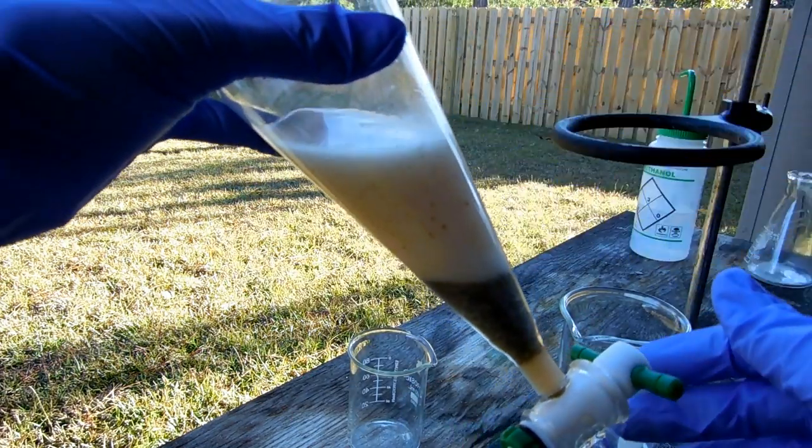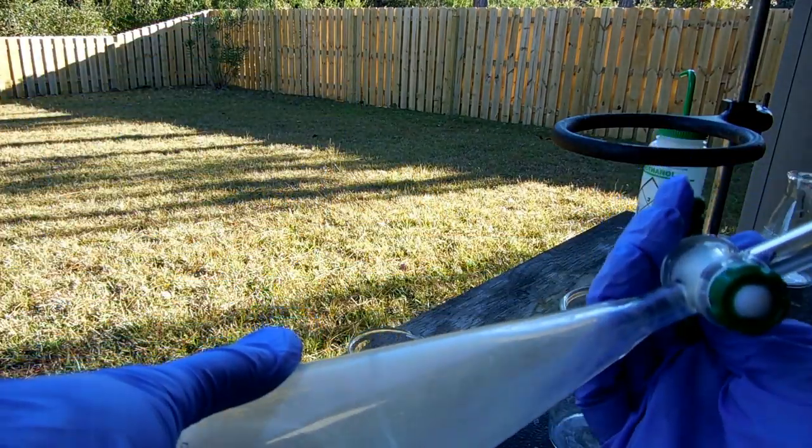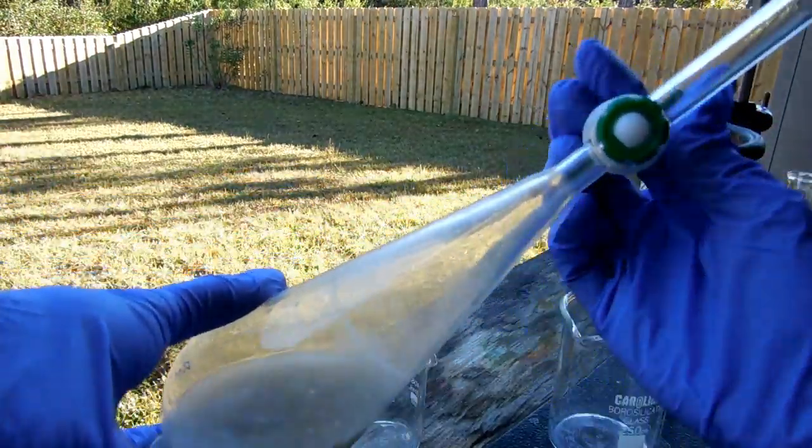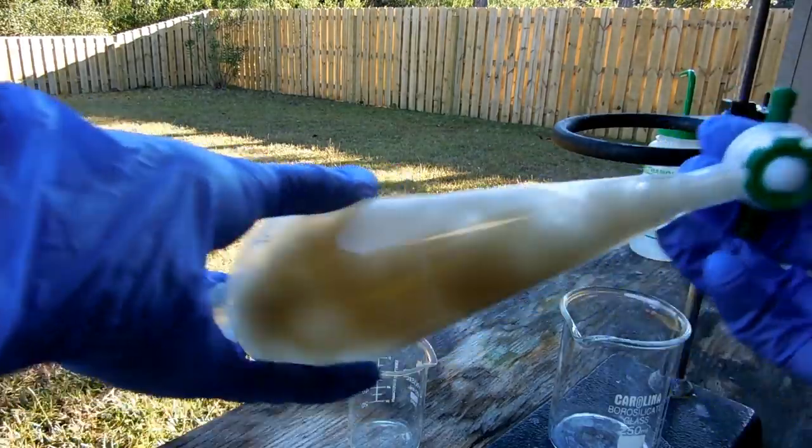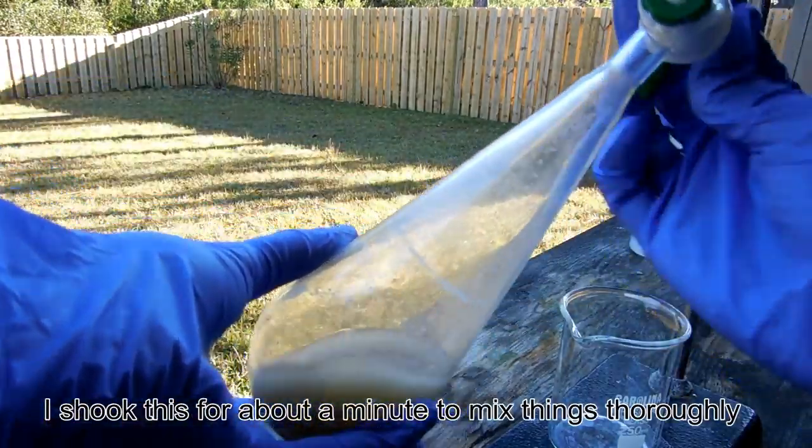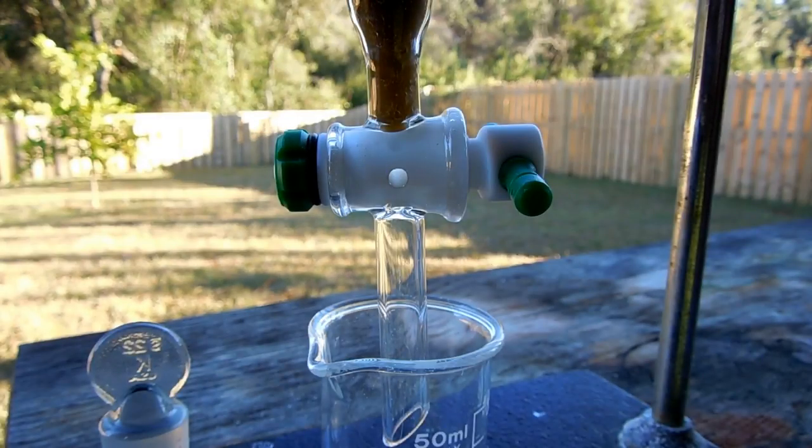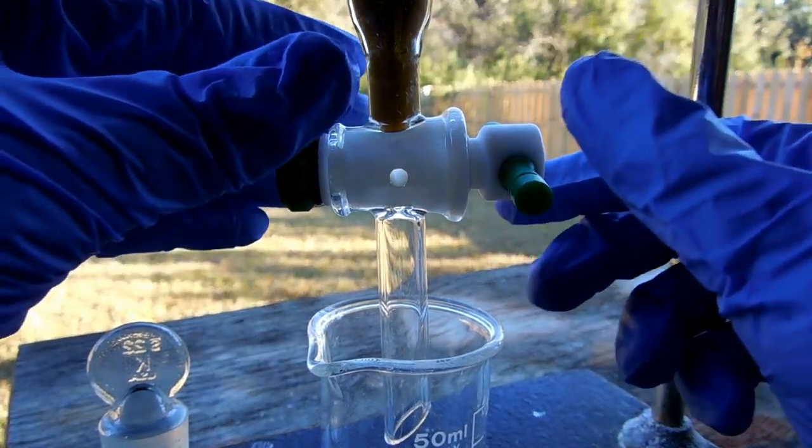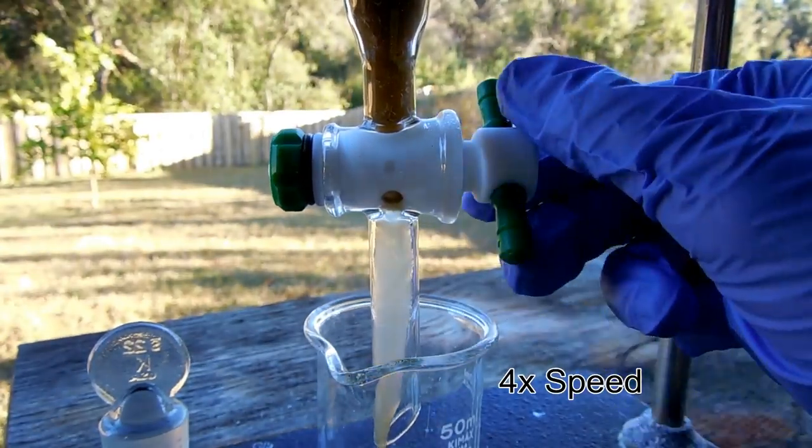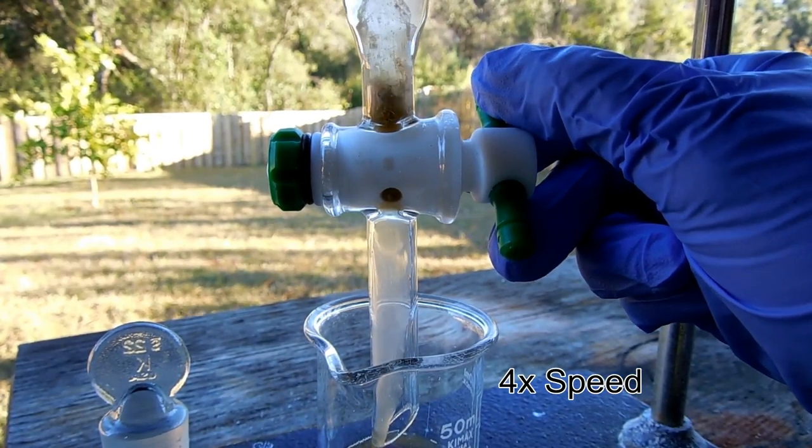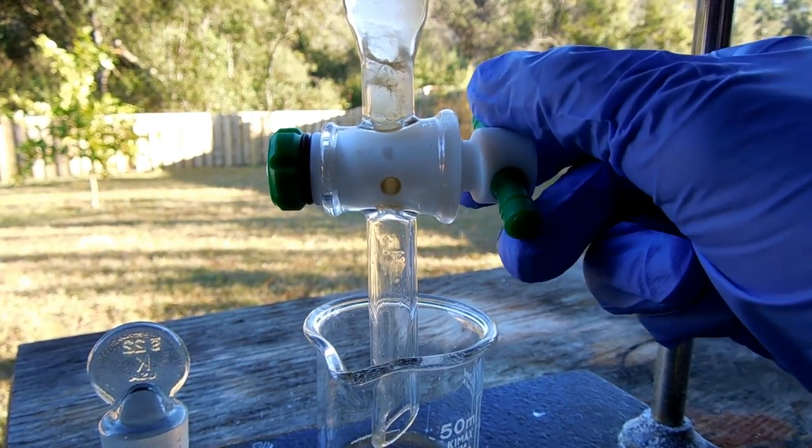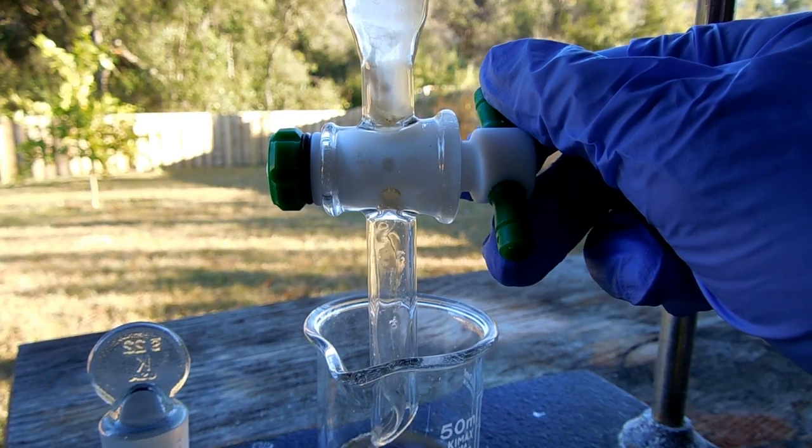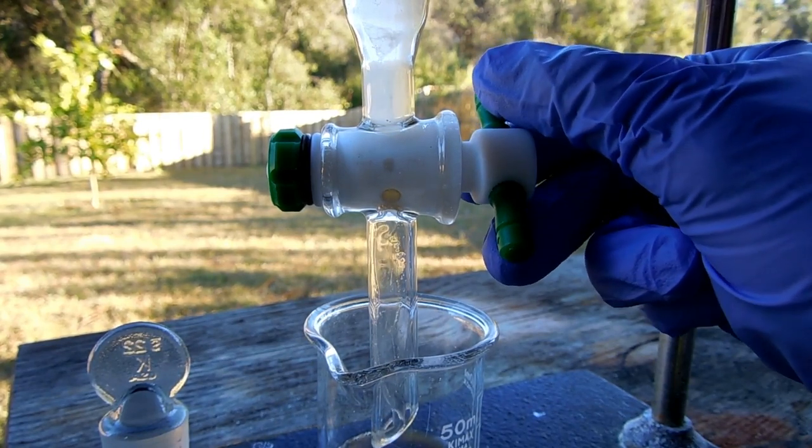When you're shaking anything in a sep funnel like this you want to vent often even if you don't expect it to produce any gases. It can still surprise you sometimes. I let my oil sit and separate for 10 or 15 minutes and the oil is heavier than the aqueous layer so we'll drain that. It's okay if you get some of the water with it because the next step is to perform a second water wash.